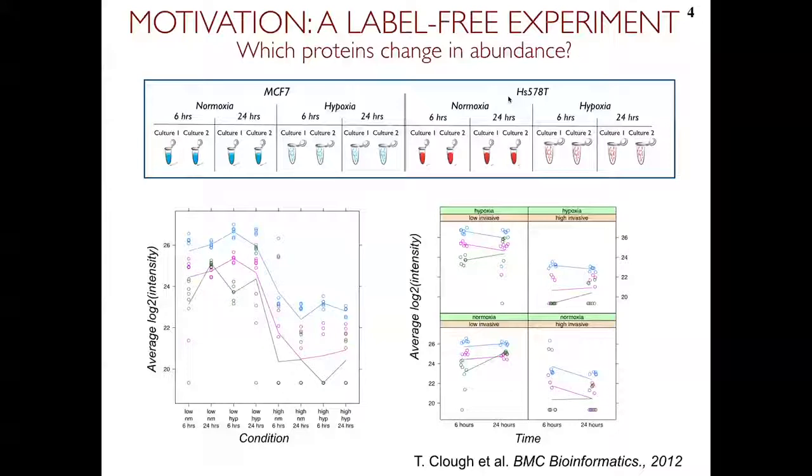Or does oxygen exposure affect different cell lines differently? So these are more complicated questions, and at that time there was really not much infrastructure to deal with this type of complex design. What the colleague was doing was literally extracting some runs corresponding to some of the questions and doing some by-hand, Excel-style manipulation with them. So it was very complicated, and we felt that we could do better than that.